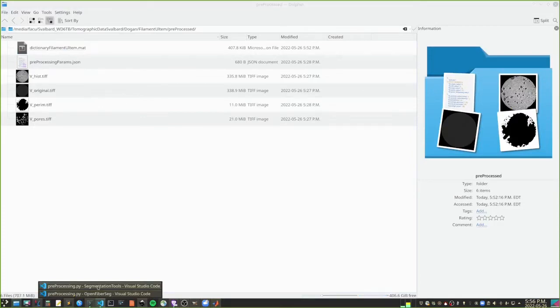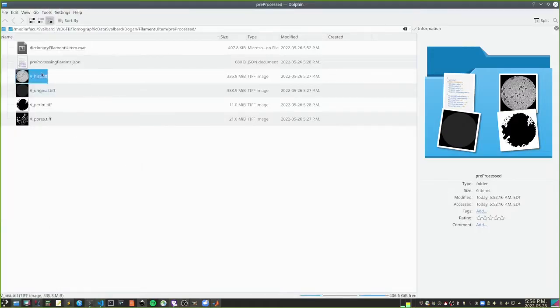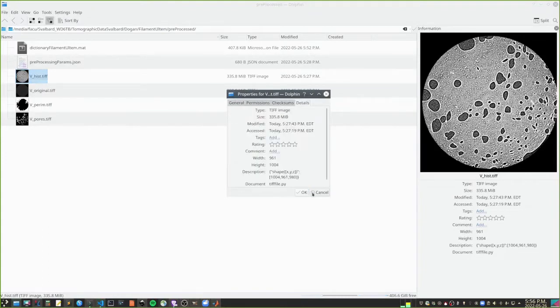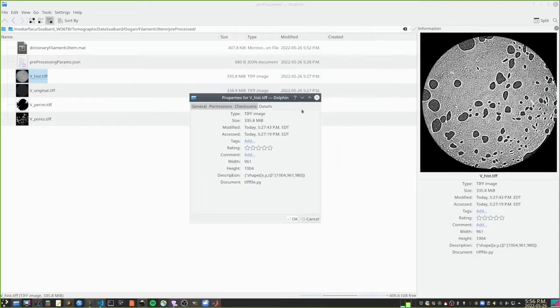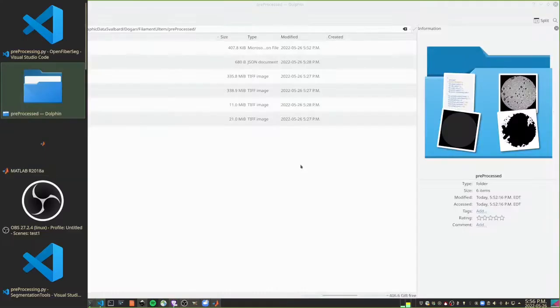If you forget, it's the one that we were using here. There's probably a way to look at the properties or something in Windows to tell you those. You see here in the properties, I have a description field. I don't know how it'll be in Windows. I'm sorry, I'm a Linux person.